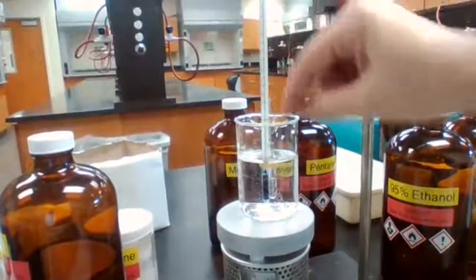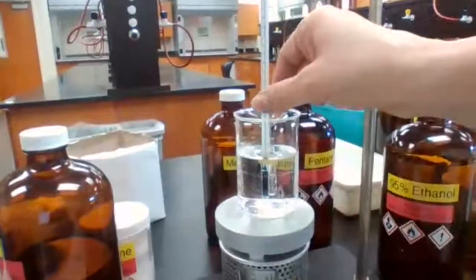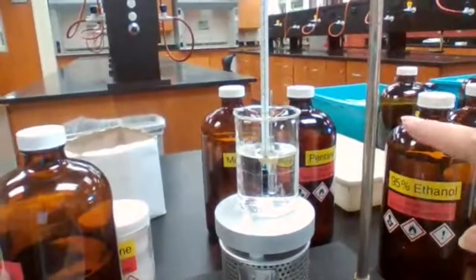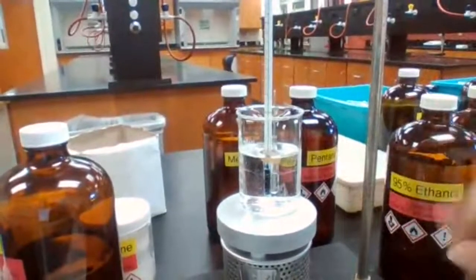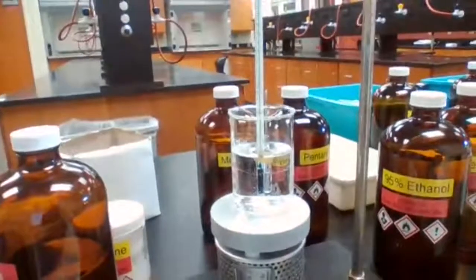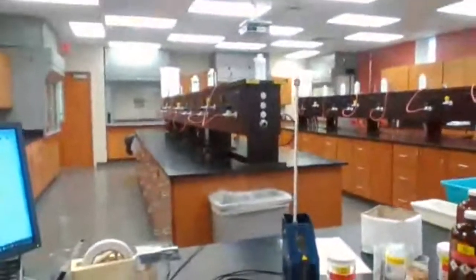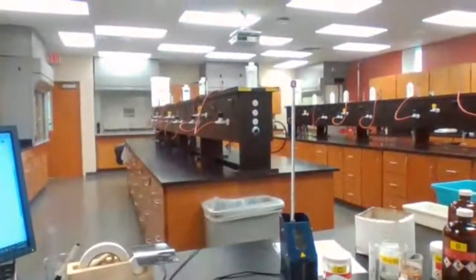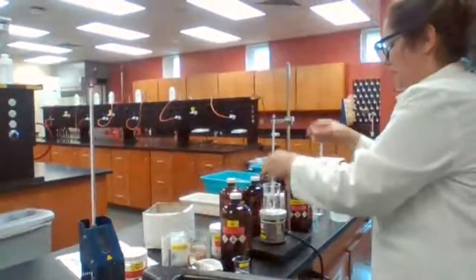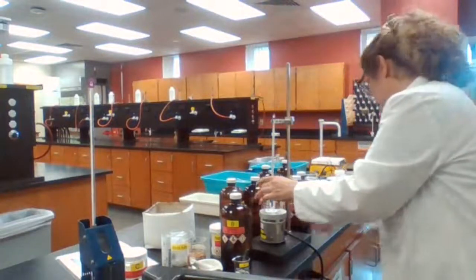I have the number for you. I already read the number. But I want you to see those bubbles coming out. That's how you record the temperature. So take a screenshot of the setup. Observe the bubbles that are forming. And the temperature was 56. The temperature for boiling point was 56. Boiling point of the unknown is 56. Okay.